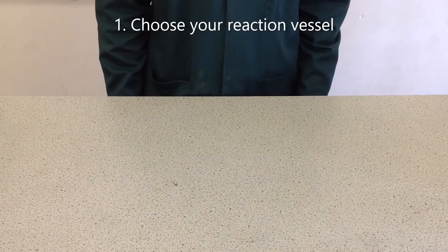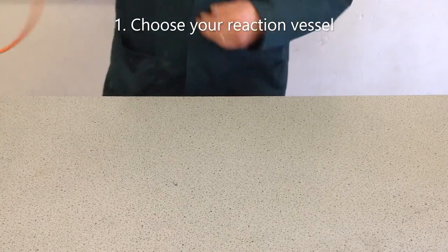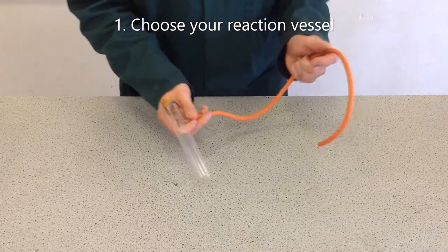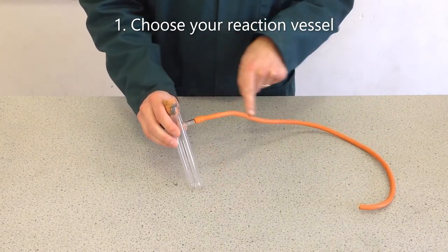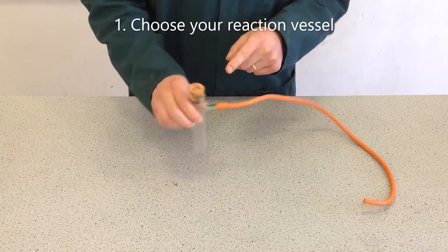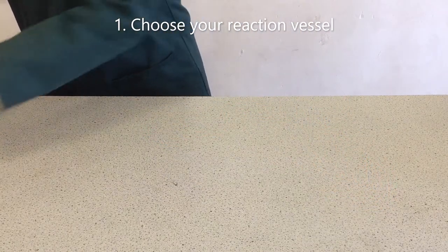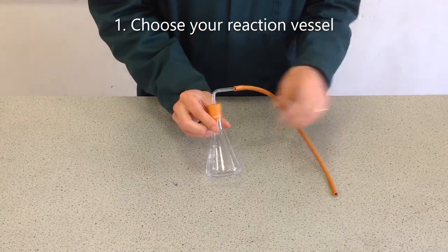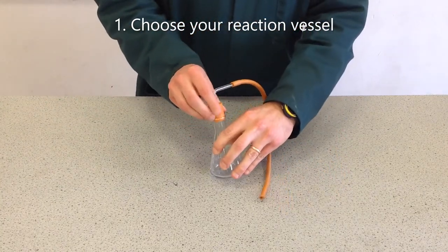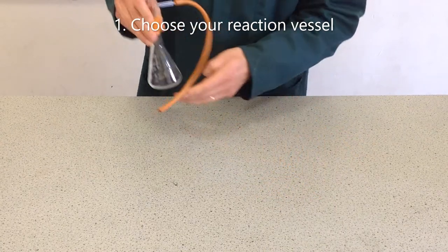The first thing to think about is the choice of reaction vessel. One possibility is this sidearm boiling tube, which has a fused glass joint and a delivery tube coming straight out of the side, with a bung in the top. Another option is to use a conical flask with a bung fitted with a bored hole through the centre, through which the delivery tube comes out.